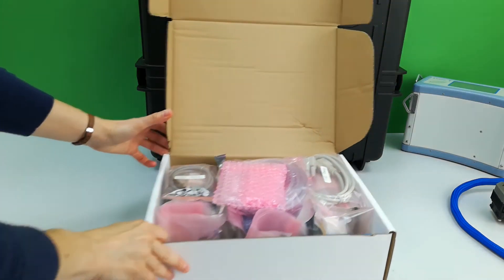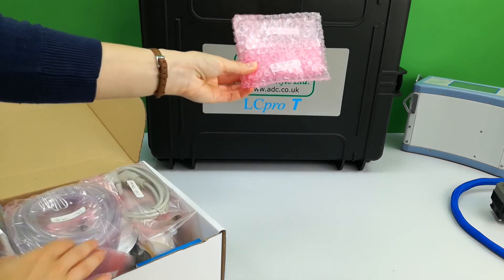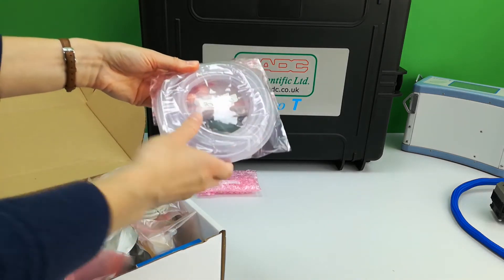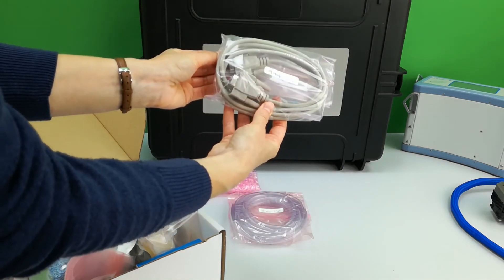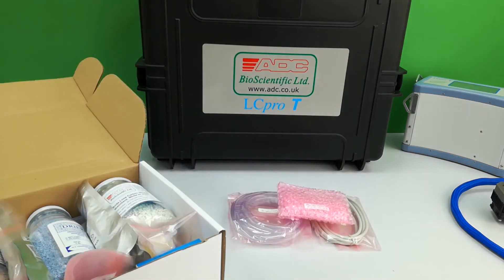The first item is a glass bulb — an infrared source. The second item, which will be used straight away, is a length of tubing for a stable air supply. Also included is a serial port cable for an alternative method of programming or data download, and a USB cable for data transfer.